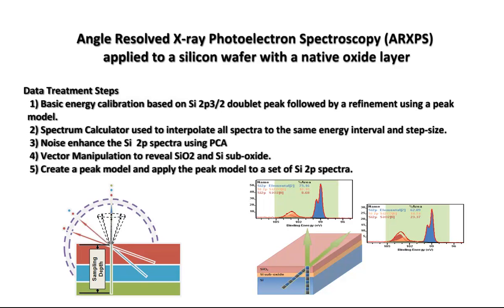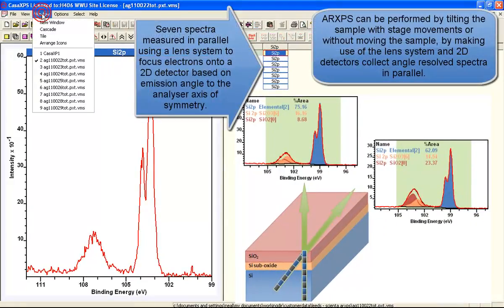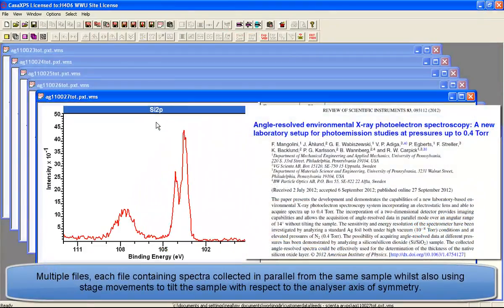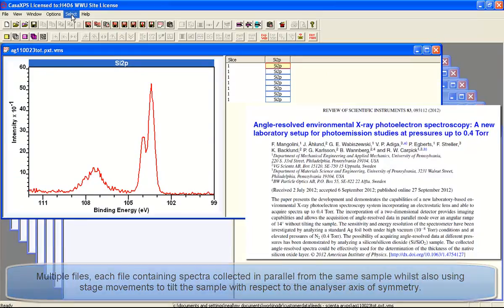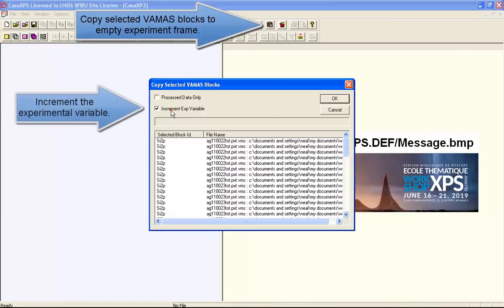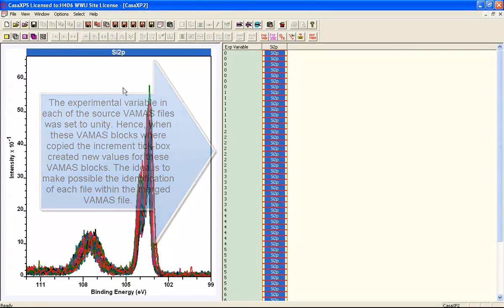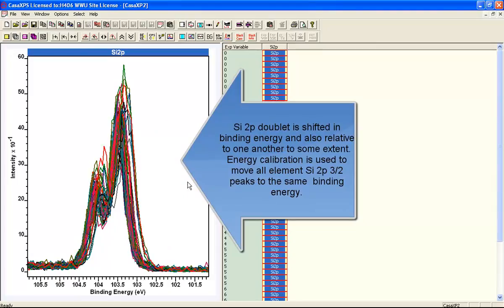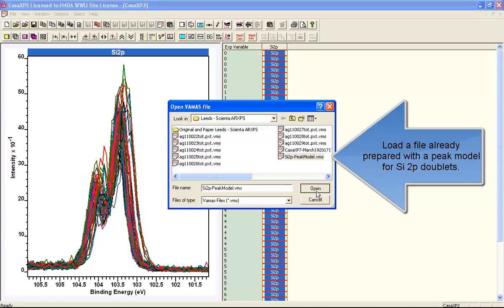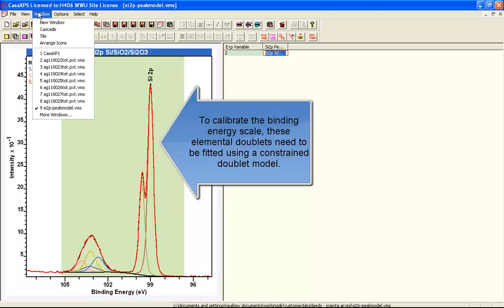One of the features of angle-resolved XPS data is the large number of spectra that can be acquired from the same sample. This sample is a silicon wafer with a native oxide layer. By tilting the sample either using the lens system or by physically tilting the sample using a stage, we get a set of silicon 2P spectra which exhibit both elemental silicon and an oxide peak. These data actually consist of the elemental and two different forms of silicon oxide.